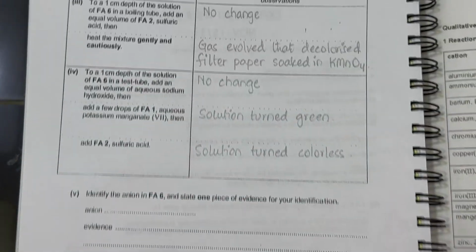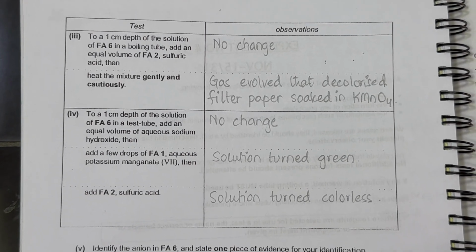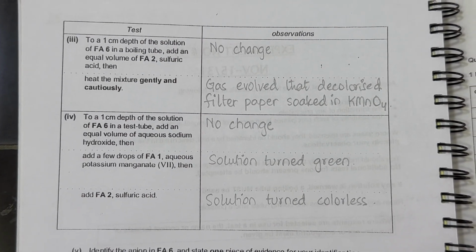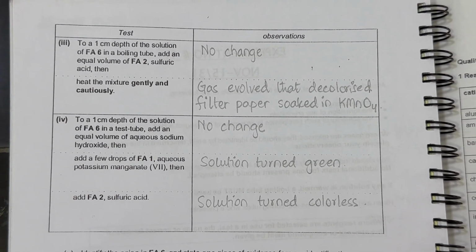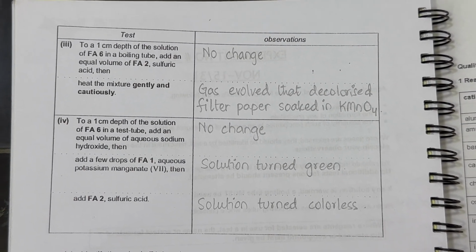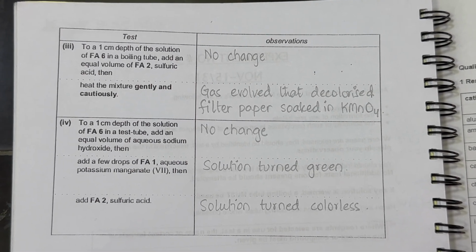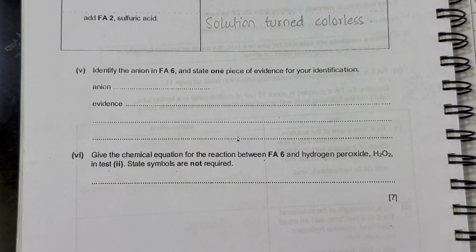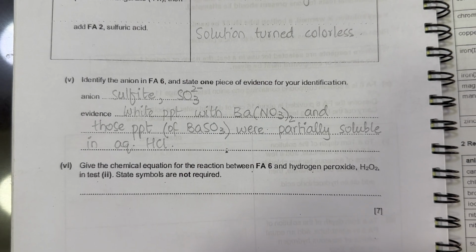And then here also we can see that if we have added sulfuric acid and gently warm, a gas is given off which is tested by aqueous KMnO4 on a paper, and that has turned colorless. So these are the two pieces of evidence. We can write any one of them here. So let me write here. So I have recorded the information here.